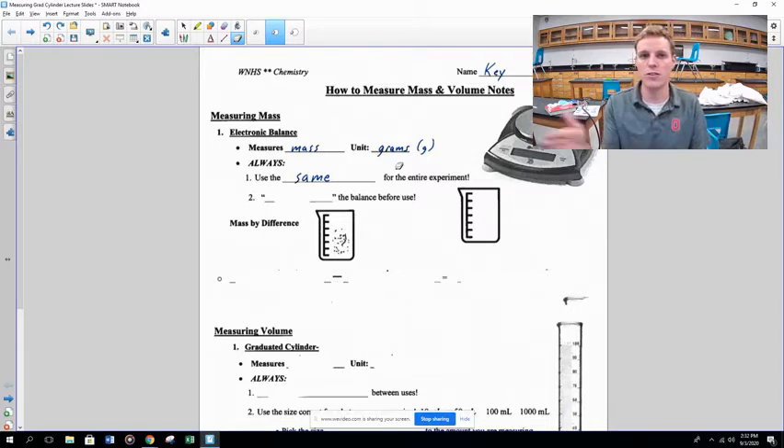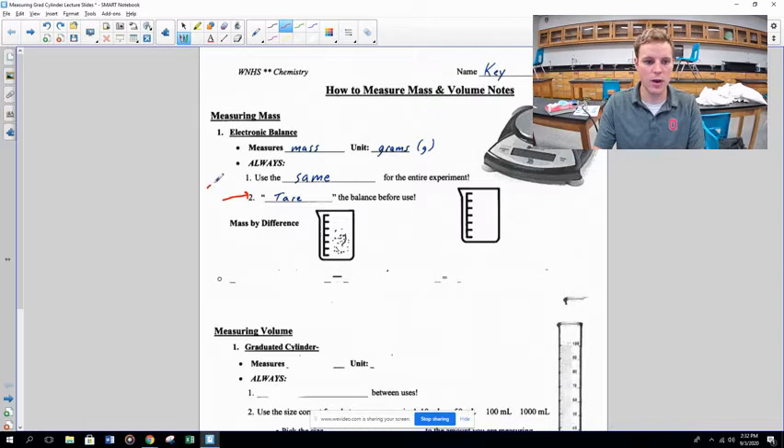The other thing you should always do is tare the balance before use — another word for this is zero the balance. You'll hear me say 'zero the balance' or 'tare the balance'; they mean the same thing. Check out the video here to see what that looks like.